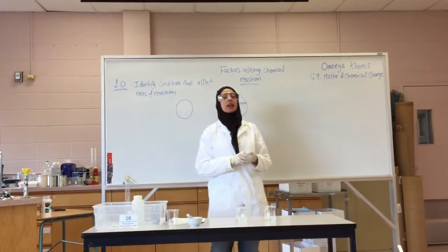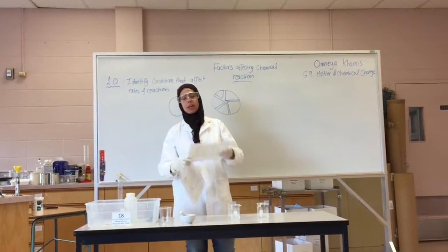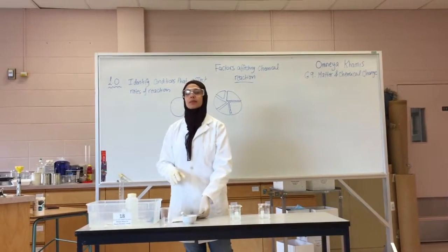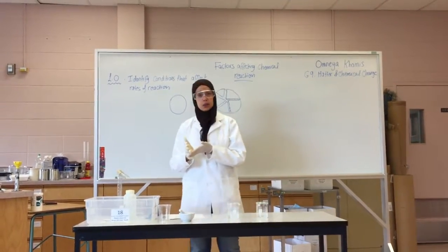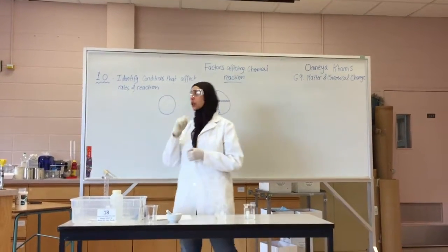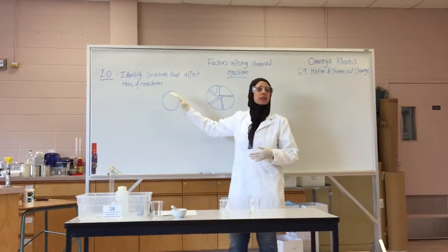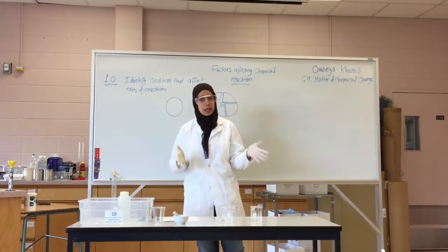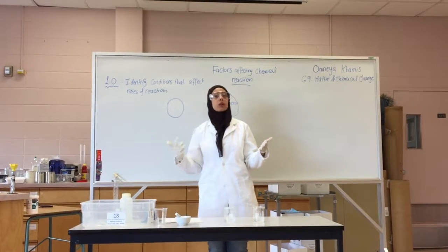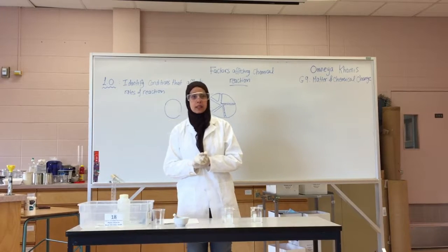So what is your final conclusion for this experiment? As you said earlier, as you increase the surface area, the rate of reaction will increase. So today we said that we have different conditions to increase the rate of reaction. We just focused today on surface area, and later we will focus on different conditions. Okay, what you will be doing for next time?